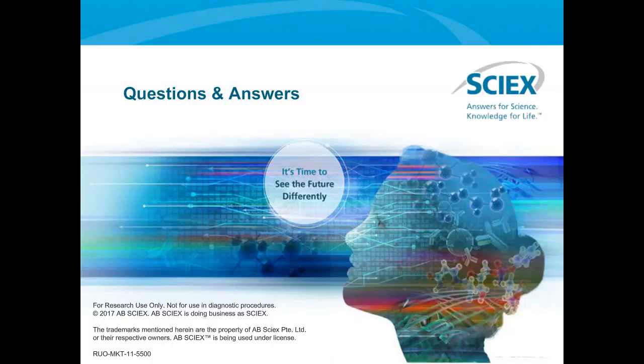What are the losses of the sample during the sample prep? When we originally worked out the sample preparation, we used radioisotopically labeled sugar molecules, and we did determine that it was better than 90%. So we are maximum losing 10%.